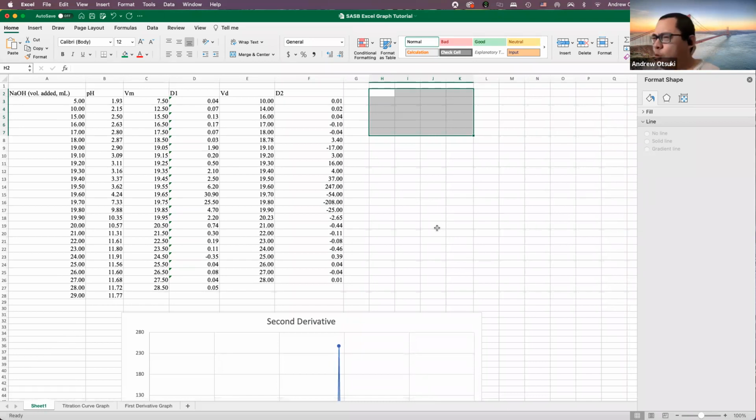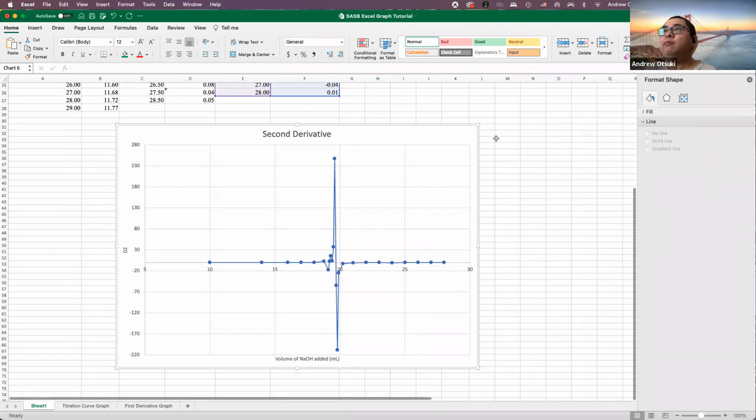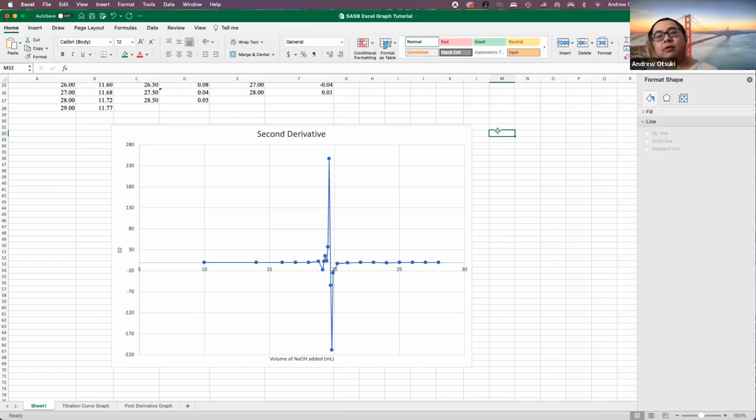Okay, so that's experiment 4, strong acid, strong base titrations, and how to do the graphs. That's the last part of the post lab. Do not put it off. It'll take some time. You don't want to rush it. And if the graphs are not nice and beautiful like this, I will definitely take off points for cosmetics. I don't want to, but the graph should represent your data in its best form. If you don't present it well, others won't take you seriously. So make sure you present your best work.